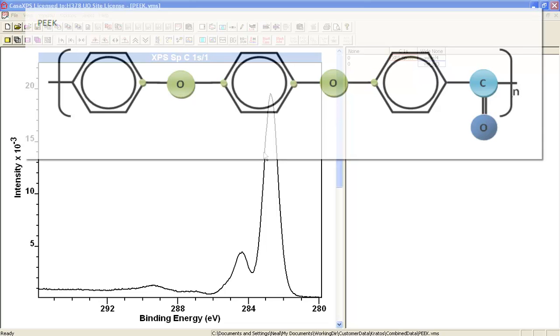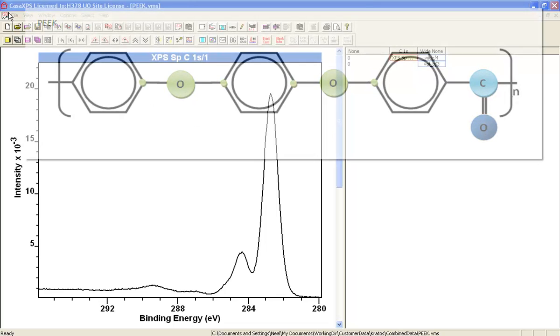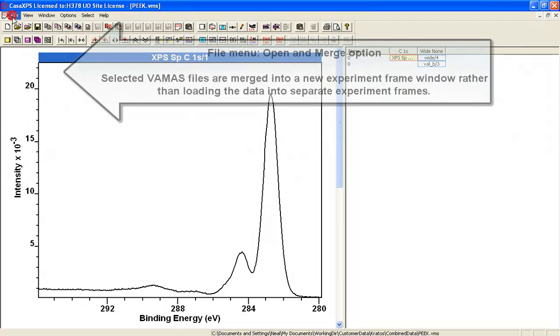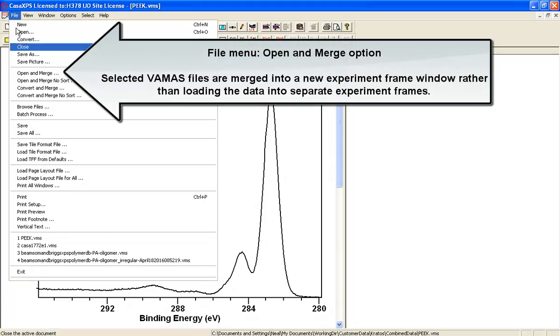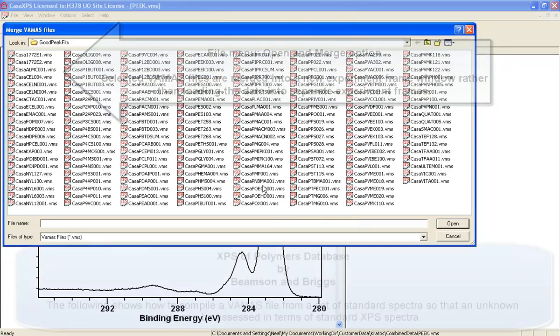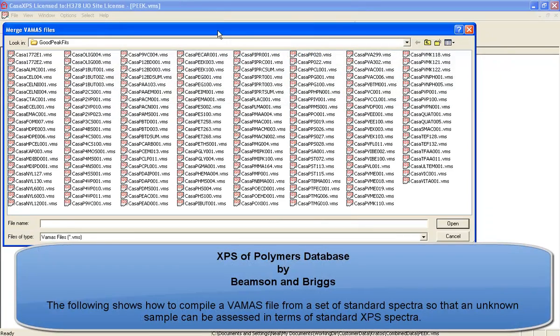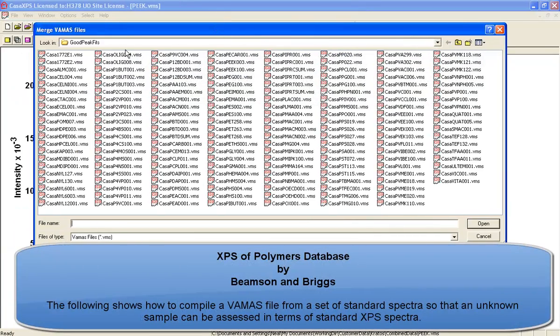These data are expected to be peak and one of the ways that we can try and understand better what a spectrum such as this is, is to look at a database.